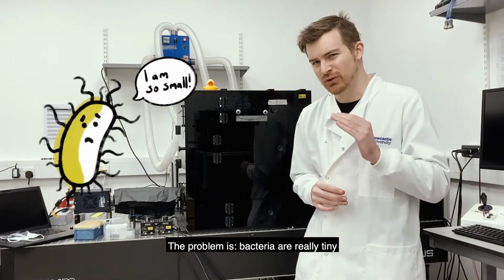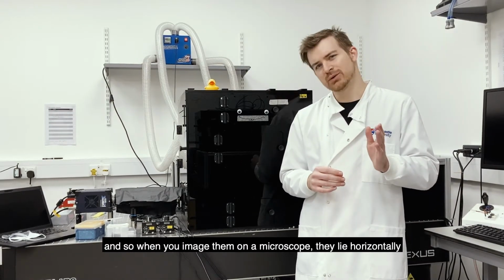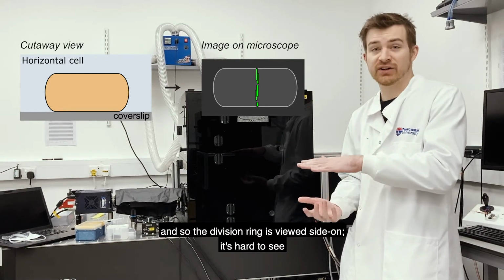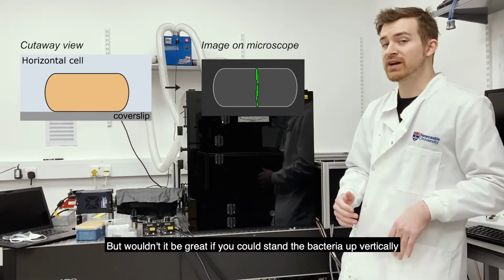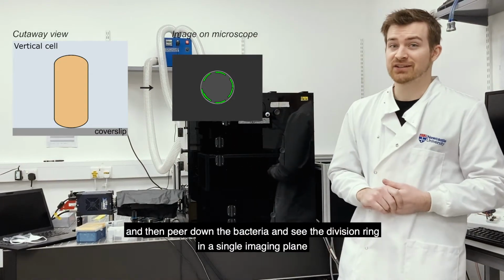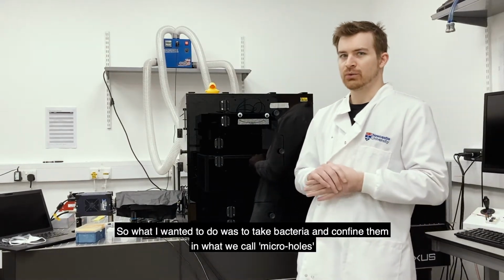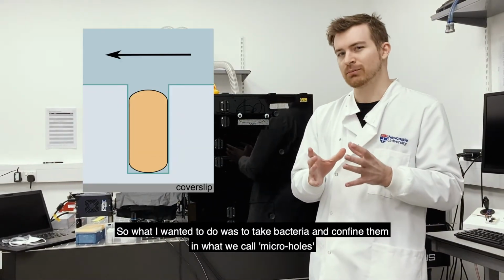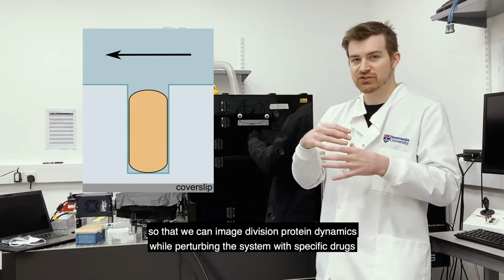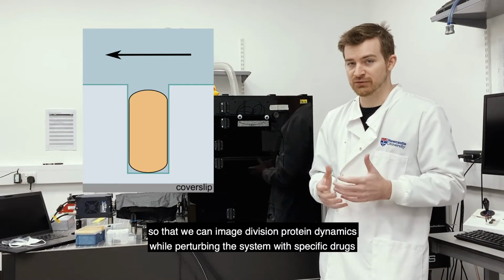The problem is bacteria are really tiny, and to make matters worse, a lot of bacteria are rod-shaped, and so when you image them on a microscope, they lie horizontally, and so the division ring is viewed side-on. It's hard to see. But wouldn't it be great if you could stand the bacteria up vertically and then peer down bacteria and see the division ring in a single imaging plane? So what I wanted to do was to take bacteria, confine them in what we call micro holes in the middle of a microfluidic chamber so we can image division protein dynamics while perturbing the system with specific drugs.